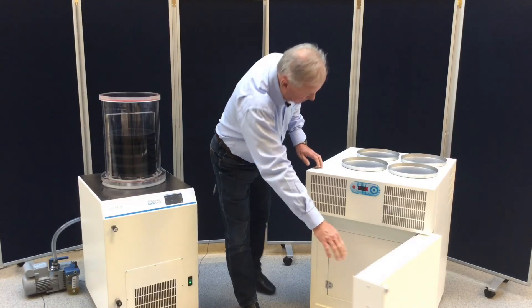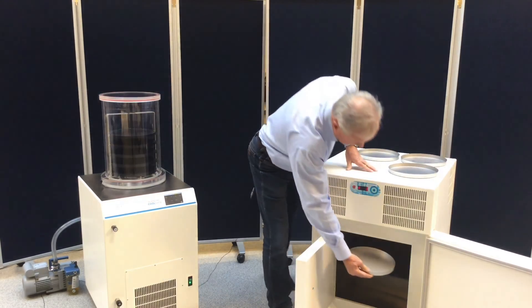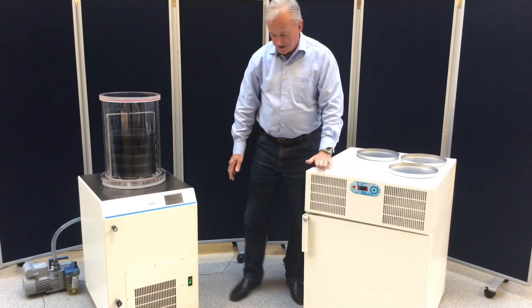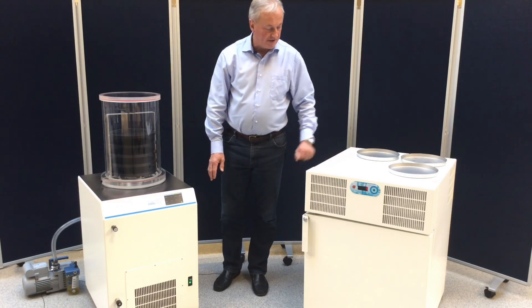We will open it, open the inner door, place our samples inside, close the door — and of course it will be all of them. When we are finished with that, it will take approximately three hours to do the pre-freezing.